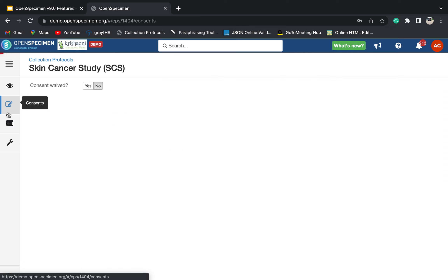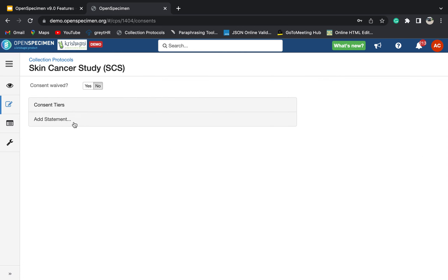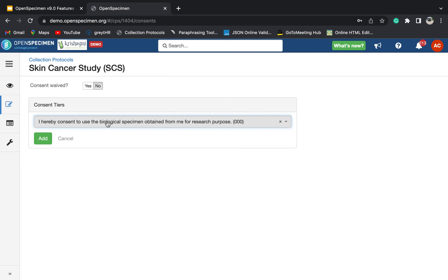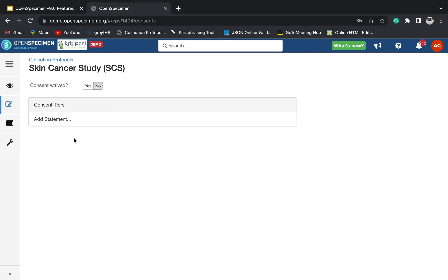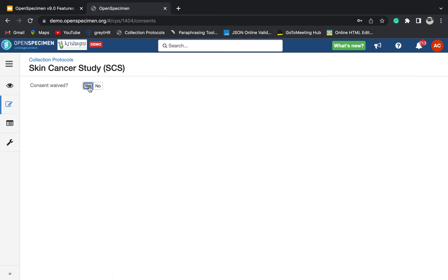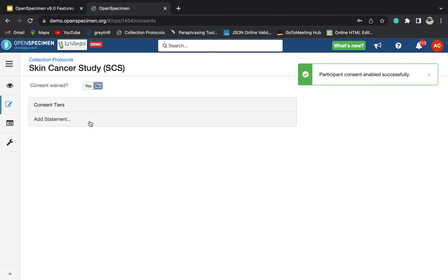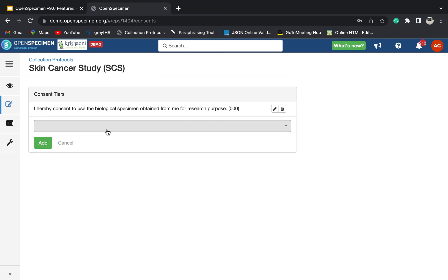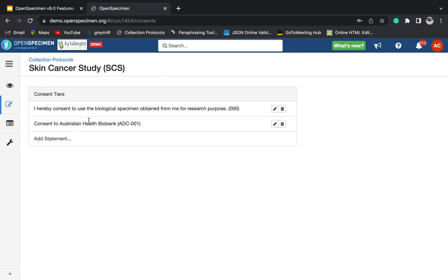This was about configuring events and specimen requirements. Now let's move to consents. You can add consents and configure consent statements to record participant responses. You can click here and these will be reflected on the participants page. If you don't want consent to be recorded in OpenSpecimen, you can click yes and the consent tab won't be visible on the participant page. I'll show you how to configure a few consents — you can select whatever consents you want to configure, select the response you want to record, and click add. This can then be seen on the participant page and the responses can be collected.